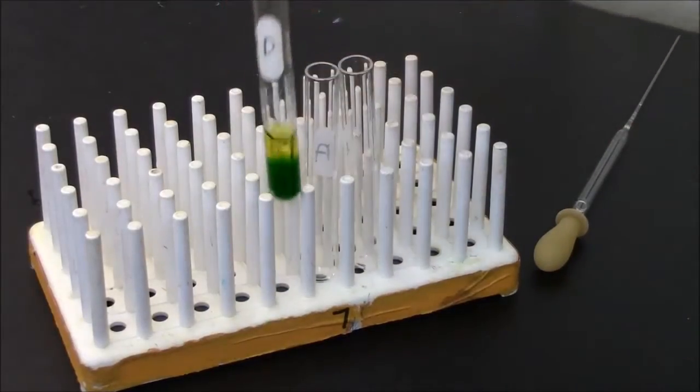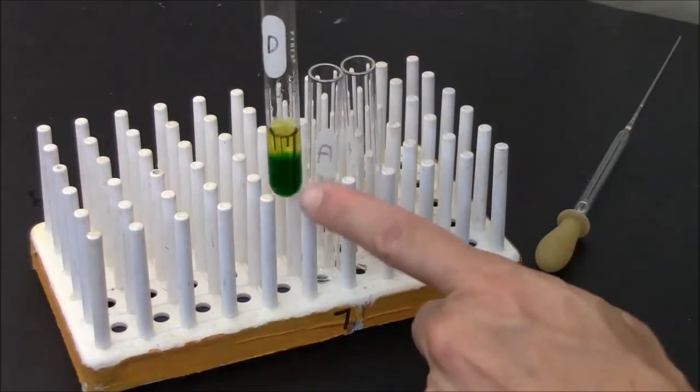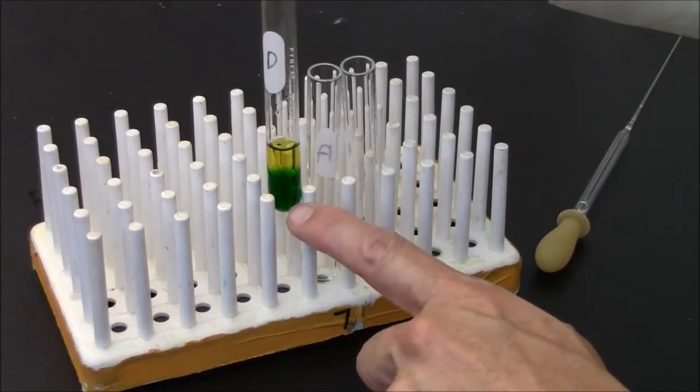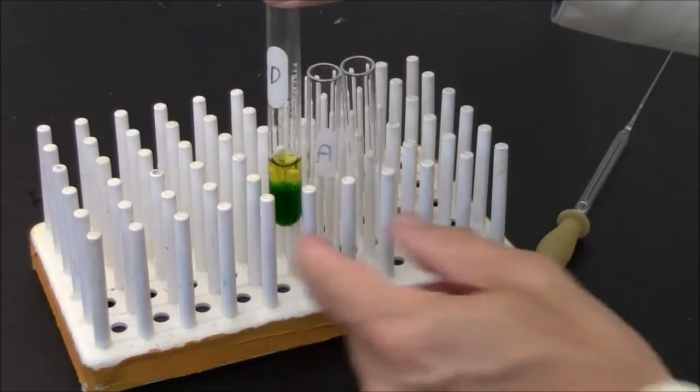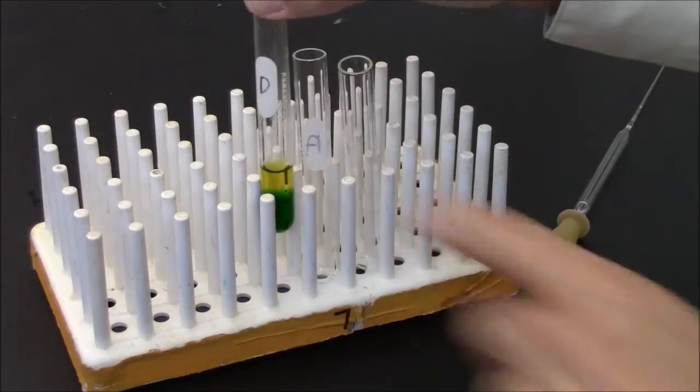There are two possible strategies I could use to separate the layers from this test tube. If I want to get a pure sample of the bottom, I'll put my pipette all the way to the bottom of the tube and pull from there. If I want a pure sample of the top, I'll pull from just the top layer.